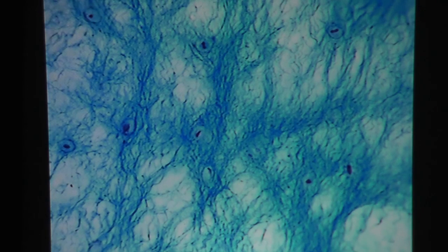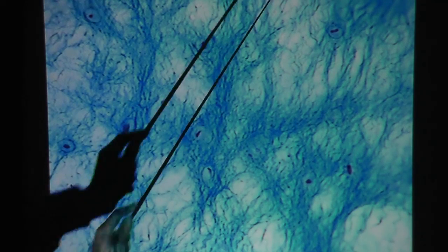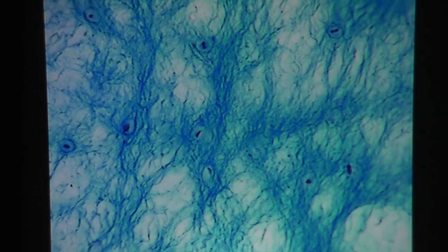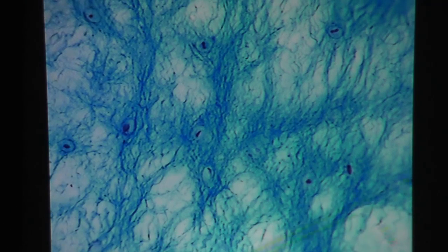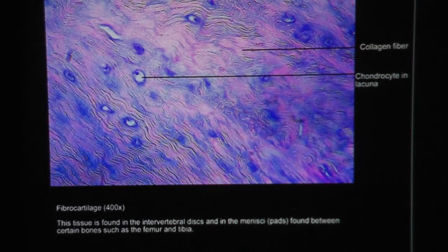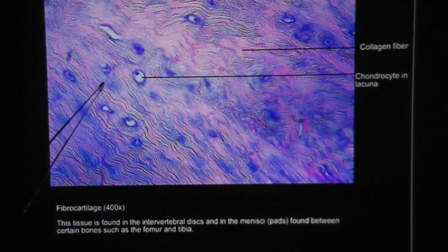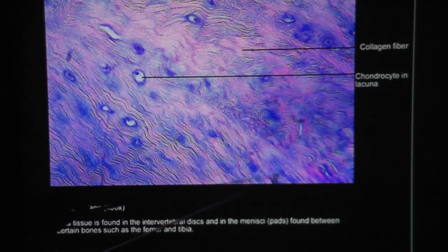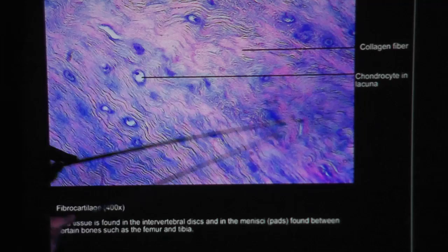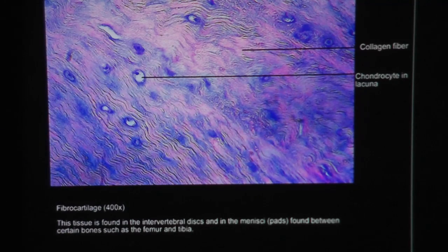One last look: lots of fibers running through the whole screen, tending to run in an up-and-down direction — long fibers. Those would be collagen fibers. And these cells, of course, are chondrocytes in lacuna because it's fibrocartilage. Another look, fibrocartilage magnified 400 times. You should see the fibrocartilage cells in lacuna — chondrocytes in lacuna. In between these chondrocytes we see wavy formations running up and down — those would be the collagen fibers.